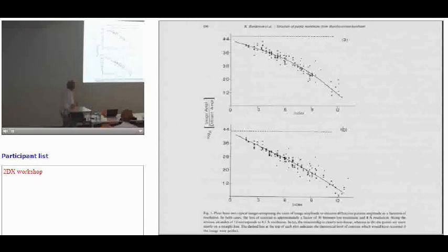This is in natural log units, so that's 4.5 natural log units, something like more than a factor of 100. So these spots out here at 4 angstrom resolution are 100 times or several hundred times weaker in amplitude than they should be. And that's 10,000 times weaker in intensity. They're very weak, but you can still see them.